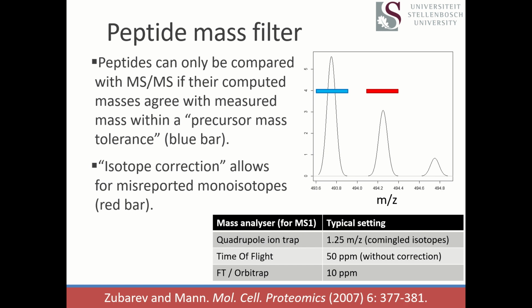Because you see, we had this problem that the instruments had pretty low resolution, and frequently your measurement of an individual peptide ion was dealing with a whole bunch of other ions all crammed in to give us this weird convolved signal. Imagine the case of a +2 peptide at low resolution. The monoisotope and the C13 peak were too close together to be resolved by that instrument. And so you end up with this massive blob of intensity, and you had to guess what the precursor M/Z was. So down here at the bottom, I've put the implications of that.